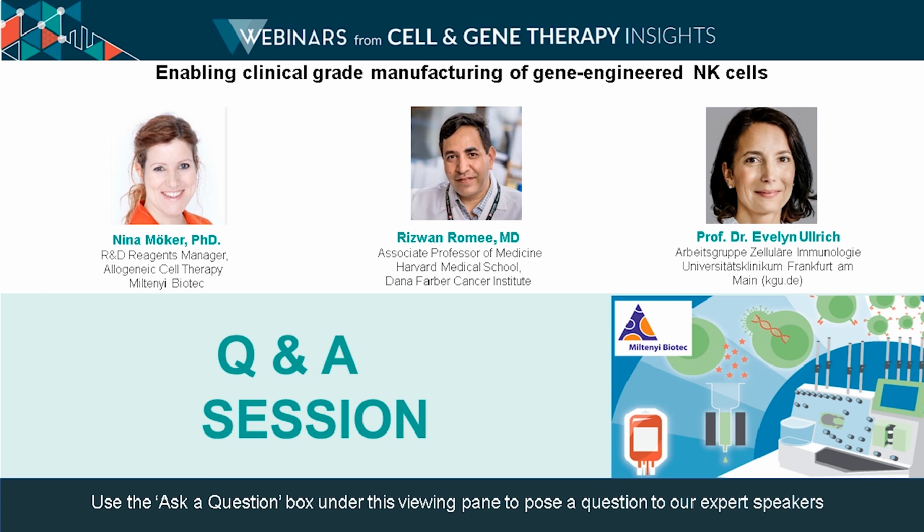And it's very important to have a panel that is very reliable, does not give any background, because this T cell count is key in the allogeneic setting to be reliable, with no false positives and no false negatives.